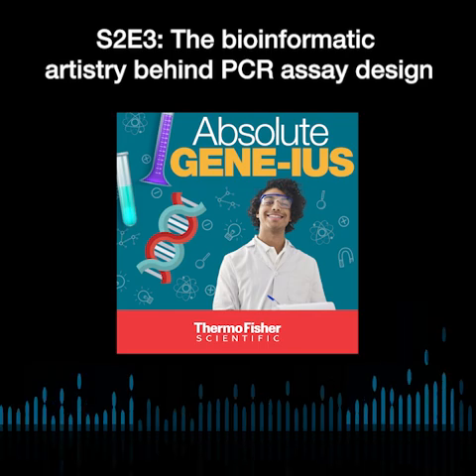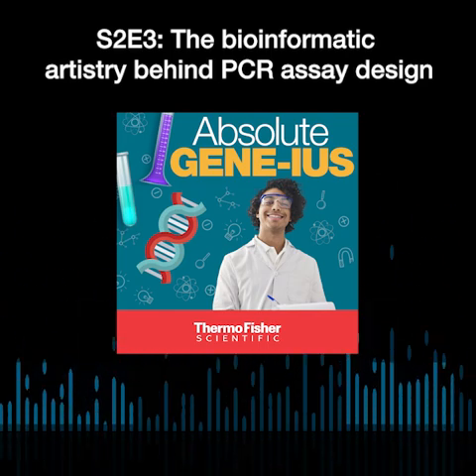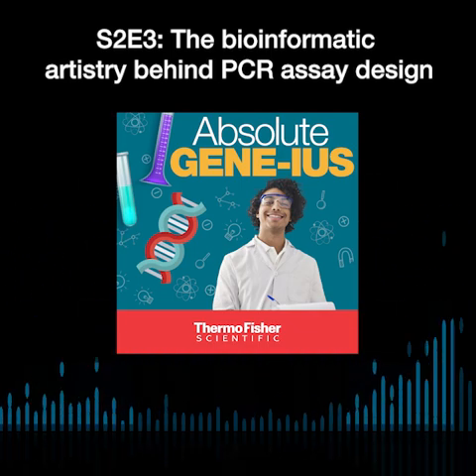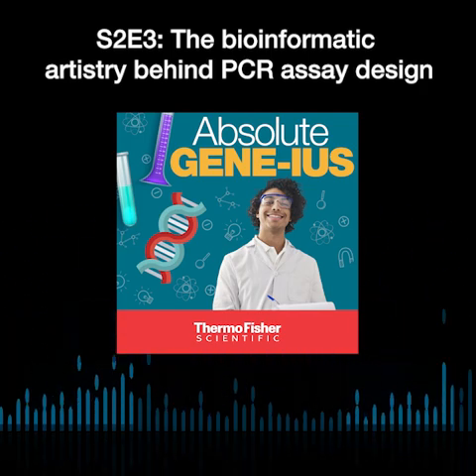Let's talk a little bit about some of the assay optimizations that happen. So let's say you are now at the stage where you have primers and probes developed. Are there considerations after that? How do you look to see that those primers and probes are behaving as expected?